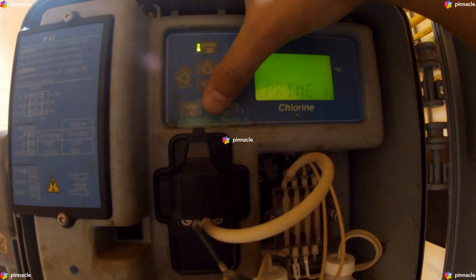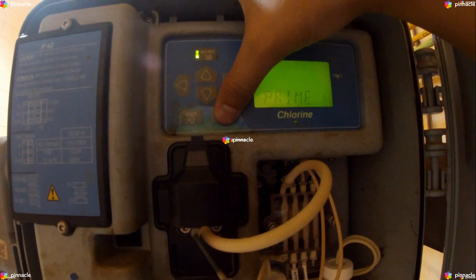Once we press Enter on Prime, this will initiate the prime process and cause the analyzer to make 39 concurrent accelerated cycles to prime the reagent lines. At the end of the 39 cycles, the analyzer will return to normal operation.